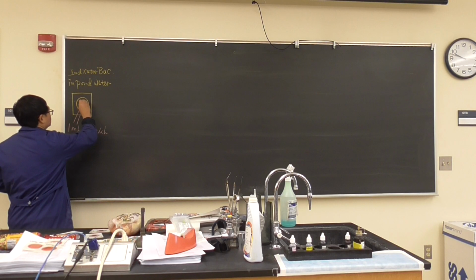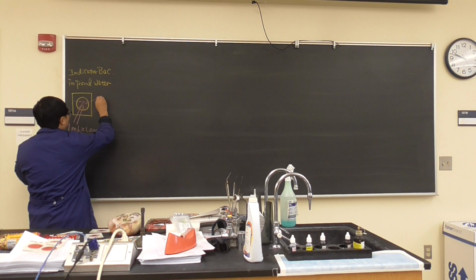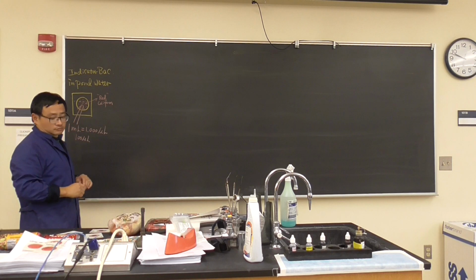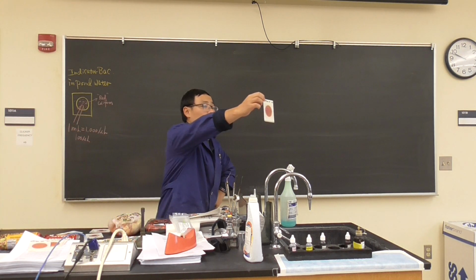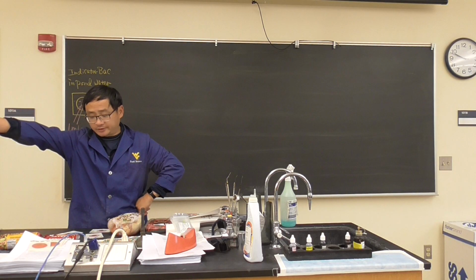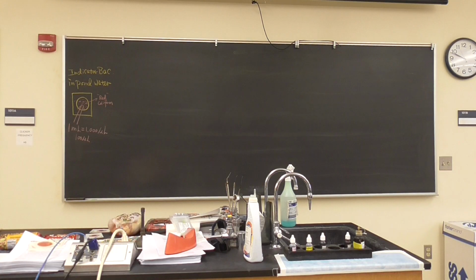Okay, now let's talk about a second question. It doesn't matter how you do it, you can see the results. Lots of you will see red dots. What's that? The red one is coliform. But you can see some of you have very good results. Look at number 32. There is a gas bubble there with blue dots. That is E. coli. I have another good example right here. Although the volume is not correct, it looks good for E. coli. That is E. coli.